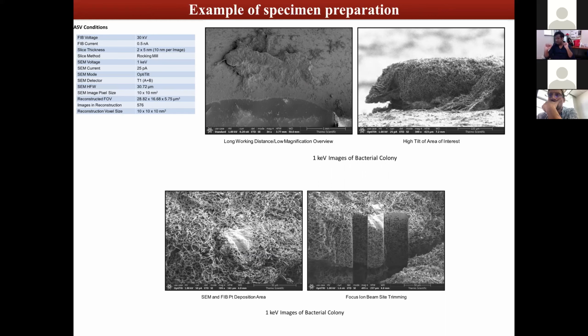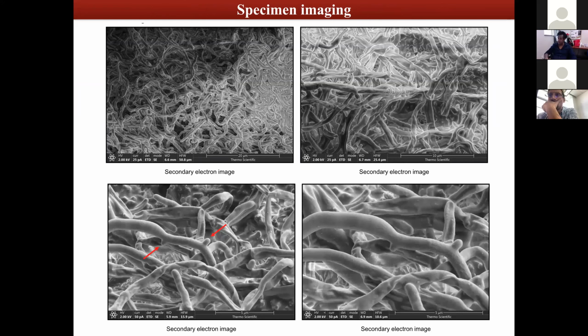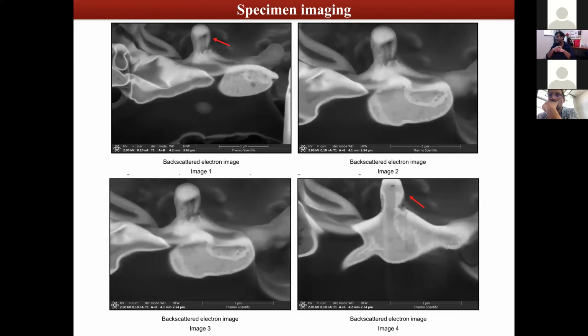Once you are in the trench, you focus in there and you see these clusters of bacteria. You find the region of your interest. In this case, those buds are our region of interest. Once we reach there, we switch to a higher magnification, we start cleaving in, and now you can see the inside details of the sample. And then obviously you can have your own programs to process the stack of images and the data set, and then generate a 3D density map.